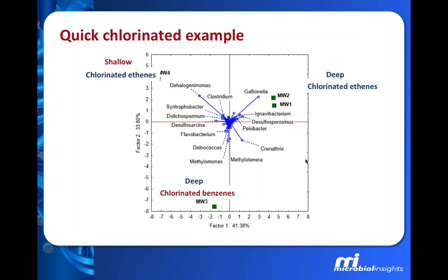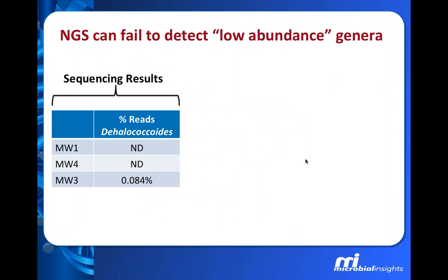But when you look at this plot, although I see a lot of organisms that can be important for portions of reductive dechlorination or for fermentation to get that hydrogen being available, like the Clostridium being there, I don't necessarily see any Dehalococcoides. So again, this is where I'd want to pull my raw sequencing results and look to see if Dehalococcoides are being detected.